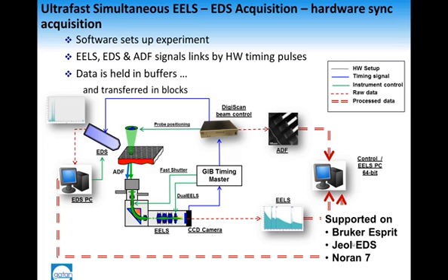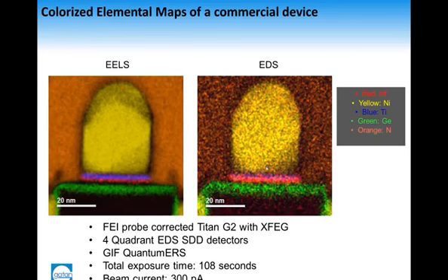Currently, we can support this on Bruker Esprit, JEOL EDS interface, and NORAN 7. Provided you have one of these detectors, we can have hardware synchronization. We can synchronize EELS and EDS signal in STEM mode using hardware synchronization.